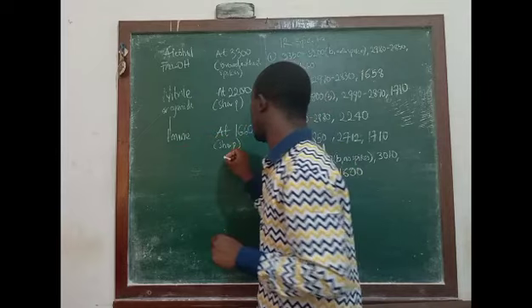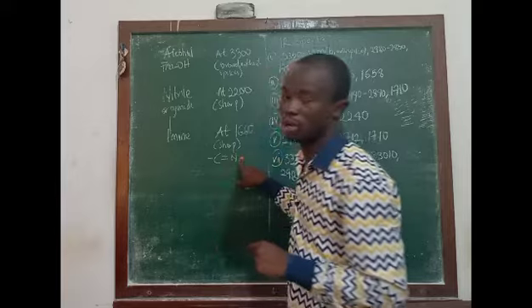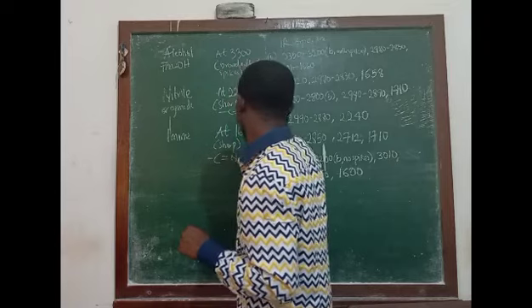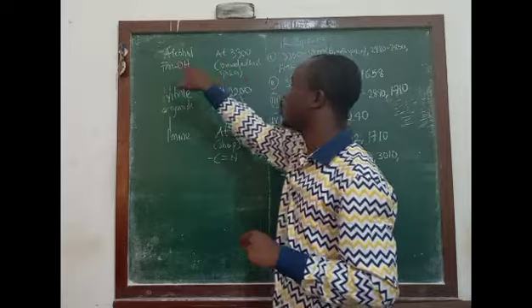And I said this signal is for the C double bond N stretching vibration. So that's what this represents. This one is for the C triple bond N. That's what this one signifies. And this one, I've said, is for the free OH group.